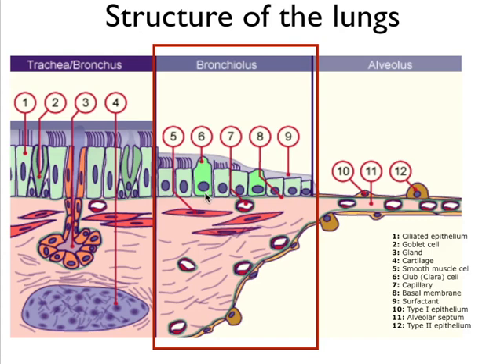And the scientific community decided that they didn't want to honor such a person anymore with a cell named after him. So they decided to ban the name Klara cell and change it into club cell. So these square domed cells are called club cells from now on.